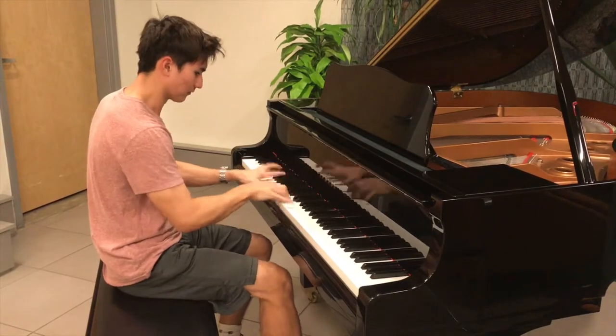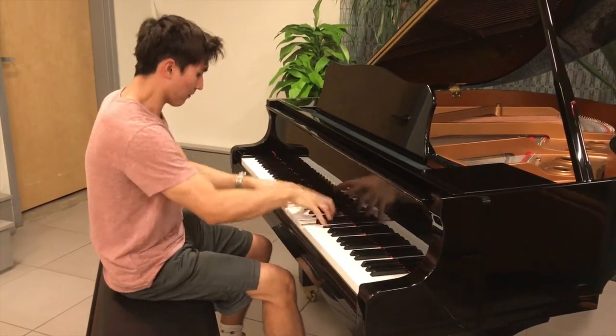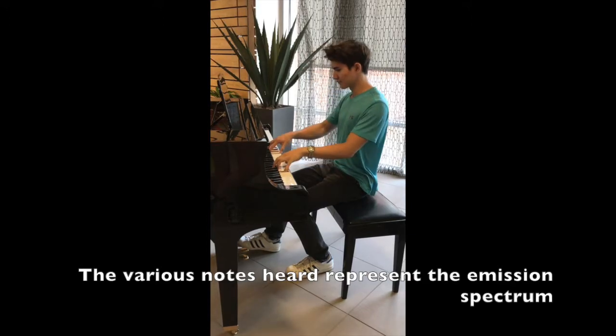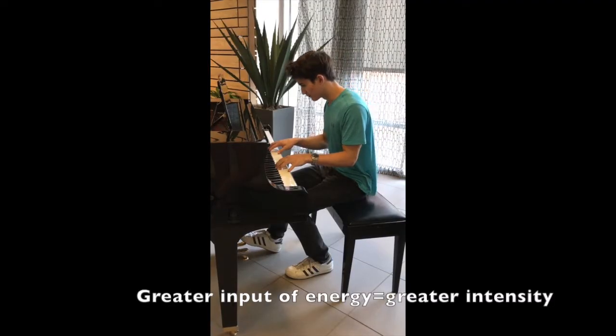To model the effect of each of these factors on emission intensity, consider a piano. When a set of keys is pressed, the output is a sound at a given volume. The loudness of each note represents the intensity of that wavelength, and the loudest note is the lambda max. When the same set of keys is pressed much harder, representing a greater input of energy into the system, the intensity or loudness of the sound is also much greater.